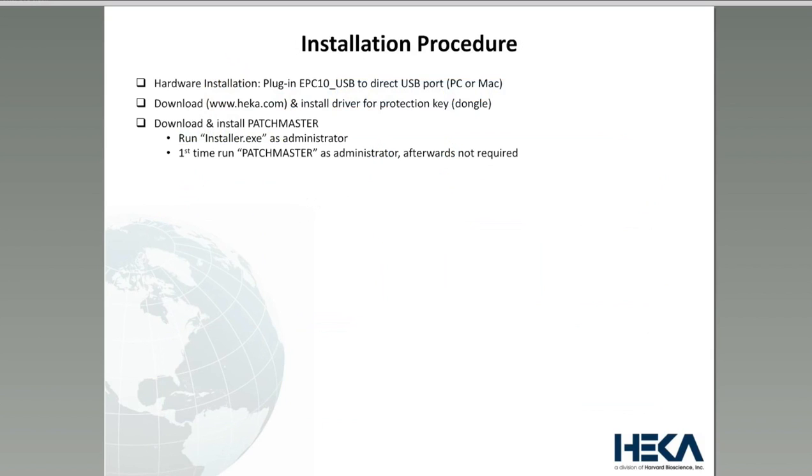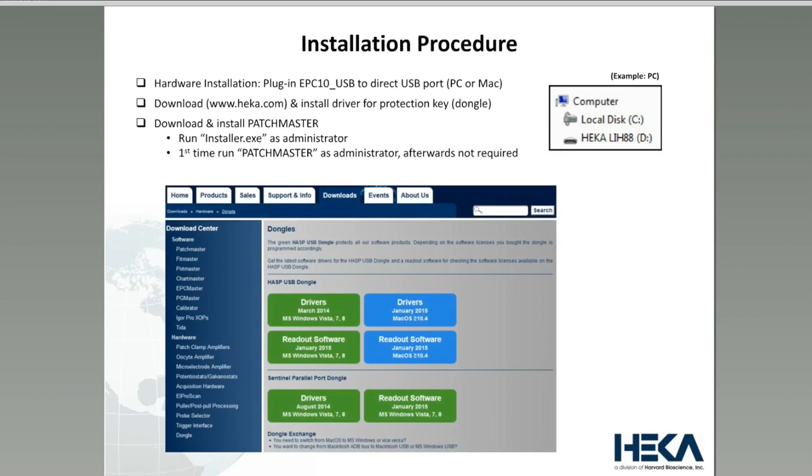This brings me to the installation procedure. The hardware installation is very straightforward. You basically plug in your EPC10 or your EPC800 USB amplifier, and the computer will automatically recognize the hardware and install a standard driver. And then your hardware will show up like this.